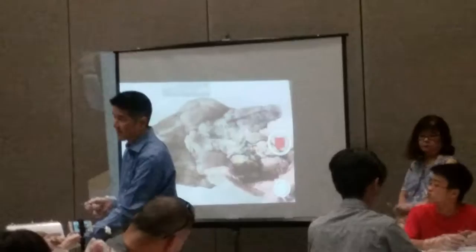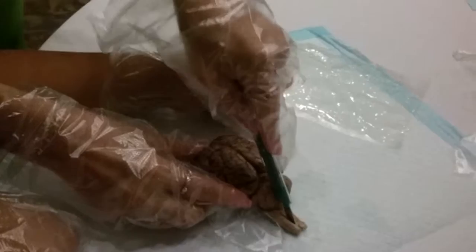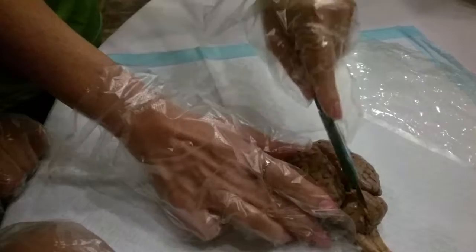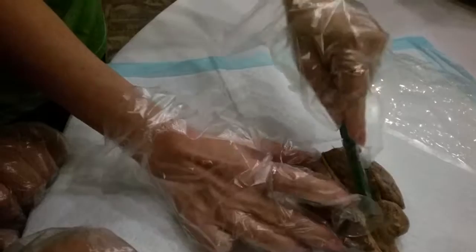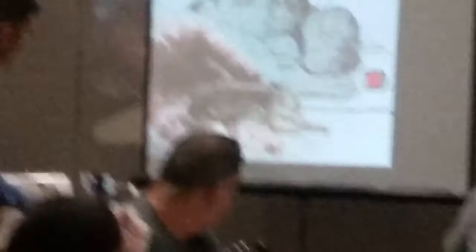We're going to cut this brain in half right down the midline, though cutting it right down the midline is easier said than done. I'm cutting through the spinal cord, and then you have to extend the cut through the cerebellum. The cerebellum doesn't have a clean midline. These branching white structures are called the arbor vitae, or the tree of life.